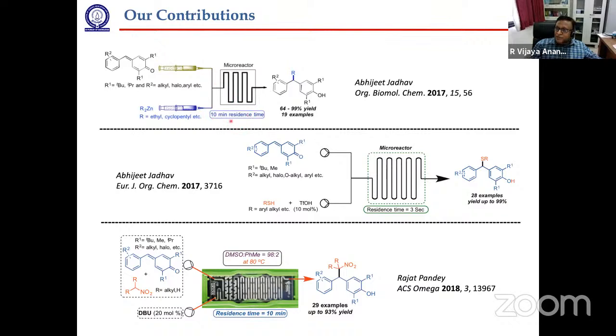Residence time is 10 minutes. It's large, I mean, the time is more here because the reaction is slow. But we get 64 to 99% yield of the products. We have many examples and we have published it.